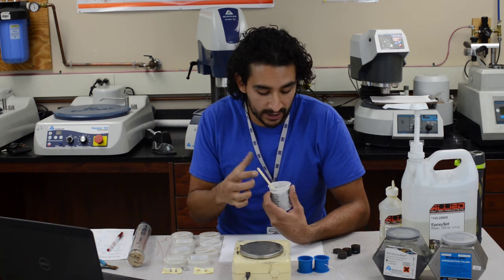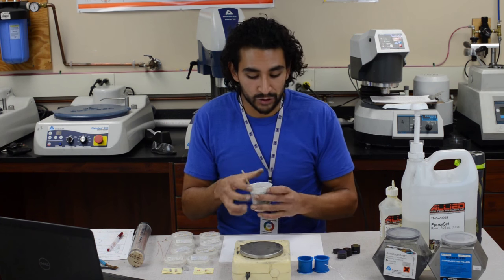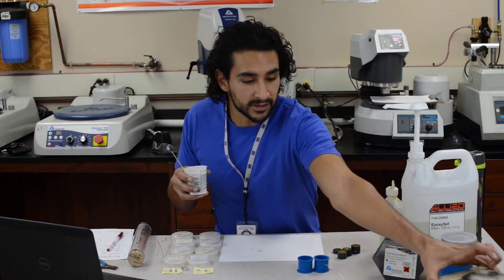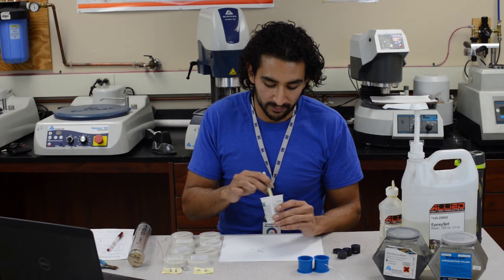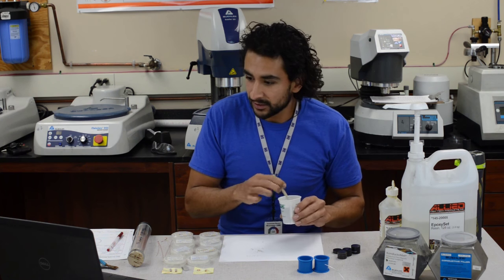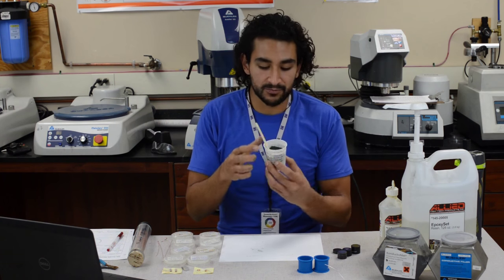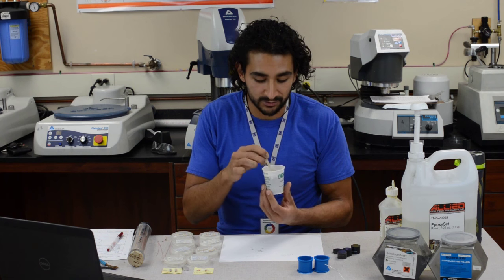I like adding this powder — it will never be as conductive as conductament no matter how much you add, but it sometimes helps under the SEM. You usually do other things to get around SEM imaging issues when you have epoxy, and I'll talk about that later. This is ready in about eight hours and will be as hard as a solid block.